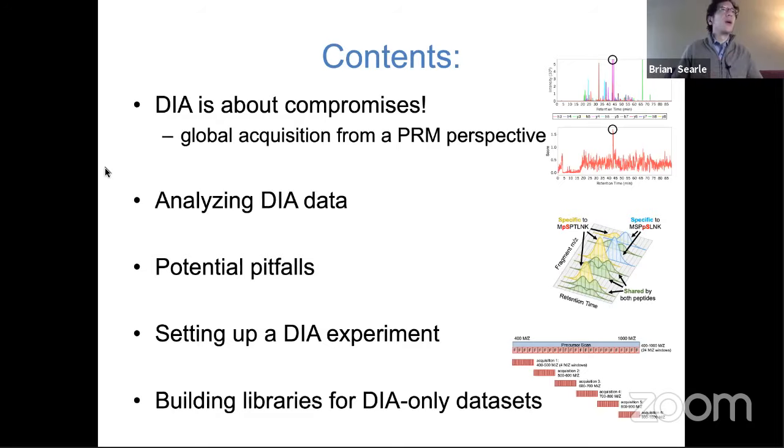Great. So can EncyclopeDIA work for MSE data from Waters without ion mobility data? In that particular case, I think that's a very difficult type of data set without ion mobility. And there, I think your best bet is to actually still use Waters software, in that case ProteinLynx Global Server, as the best way to interpret that type of data. I wouldn't necessarily use EncyclopeDIA in those particular cases.